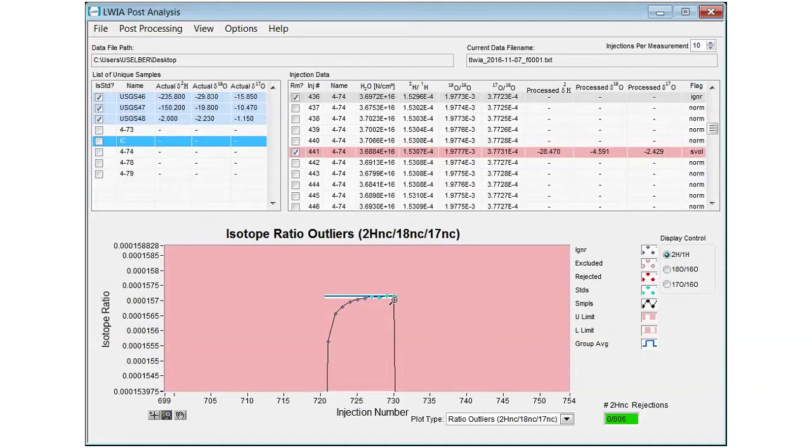What we have found is if you have the physical filters turned on, you almost never see the statistical filter showing any rejections at all, because the physical filters have handled that in a known physical way.